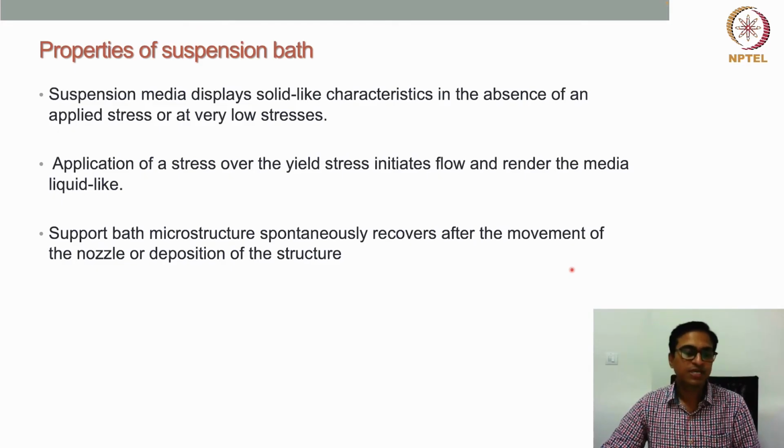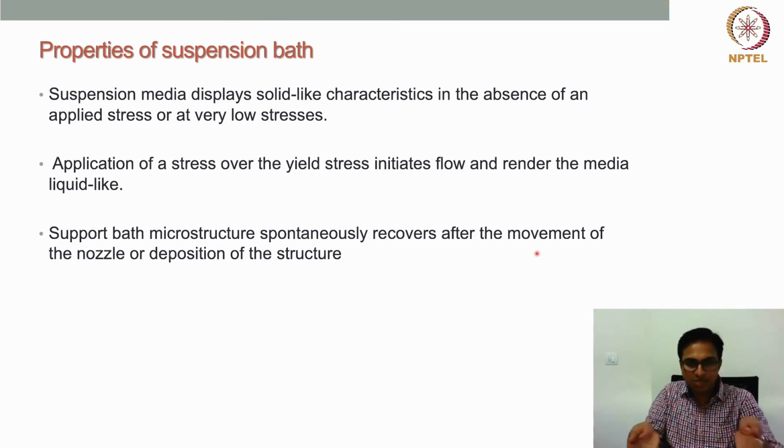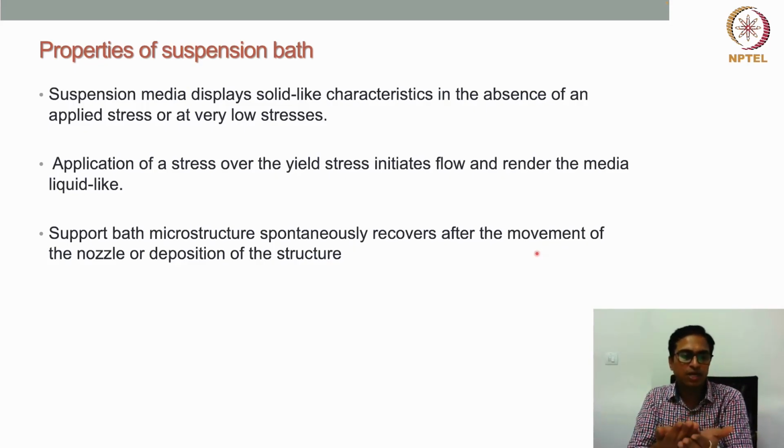Another important property is the self-healing property of this suspension bath or support bath material. That means the support bath microstructure spontaneously recovers after the movement of the nozzle or deposition of the structure. That means when the printing is done, the deposition is done, at that time the support bath microstructure will again come back to their original position, and they will encapsulate the printed structures, and then again they will behave like a solid, and they can provide support to the printed structures. So these are the important properties of the support bath.